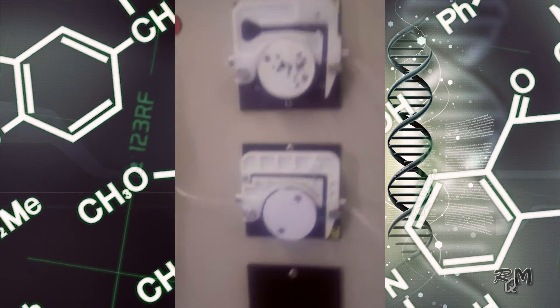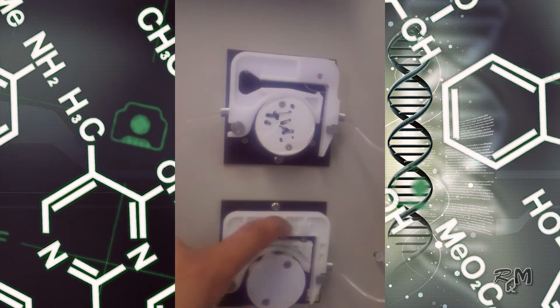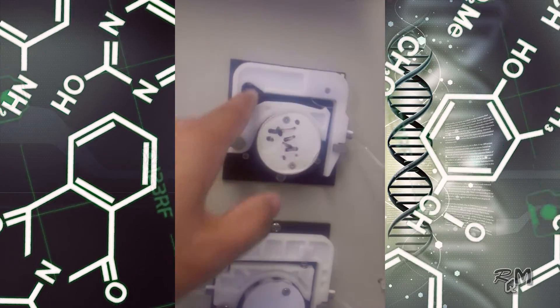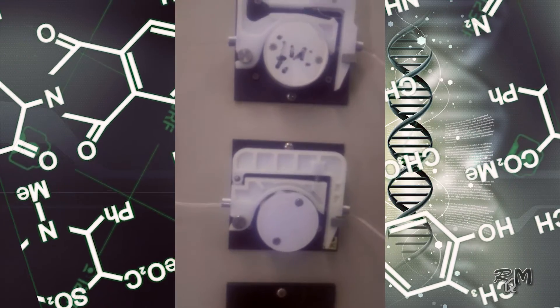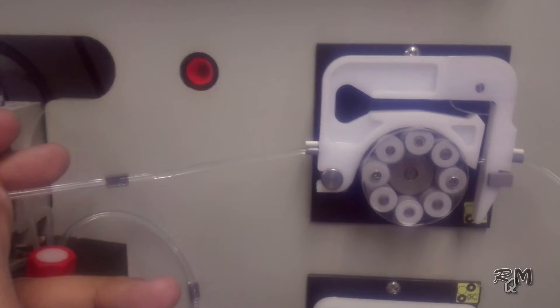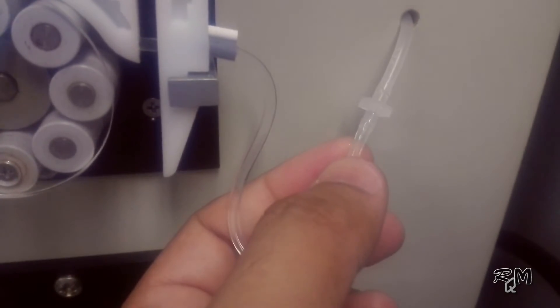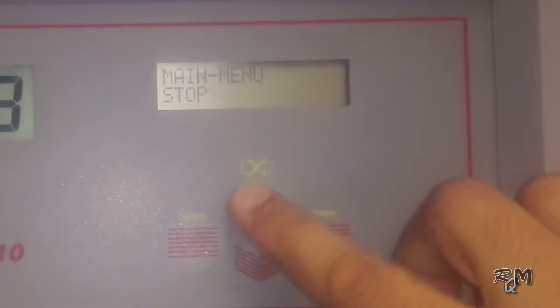Now we see the peristaltic pump. There are two peristaltic pumps: one for conditioner and the other for titrant. The peristaltic pump has a synchronous motor with constant output to ensure accurate flow. Ensure both peristaltic pump tubes are new and healthy, and properly connected on both sides. Make sure there is no air gap which can reduce the efficiency of the pumps. Now we switch on both pumps.